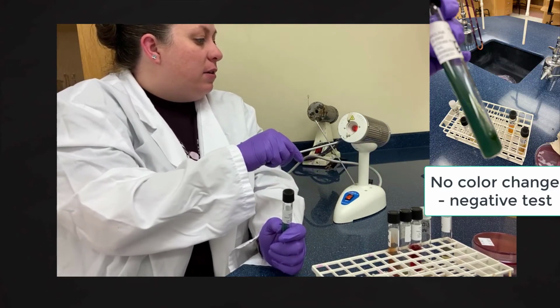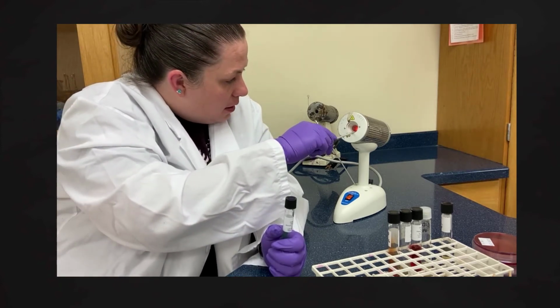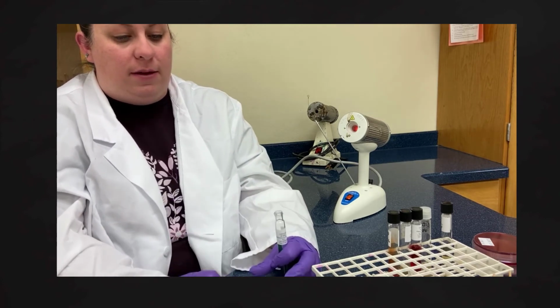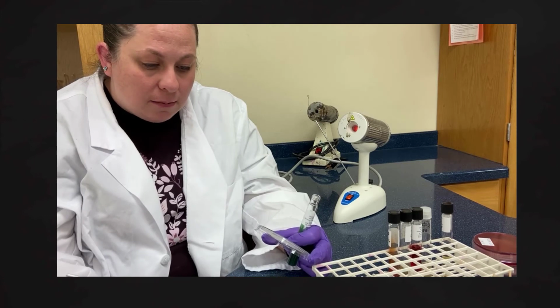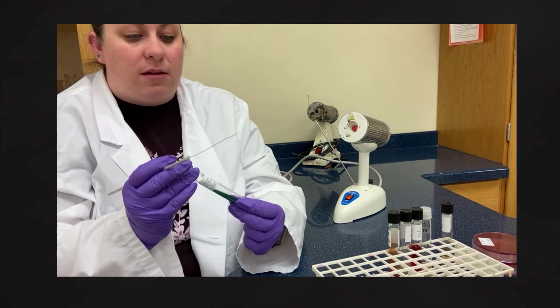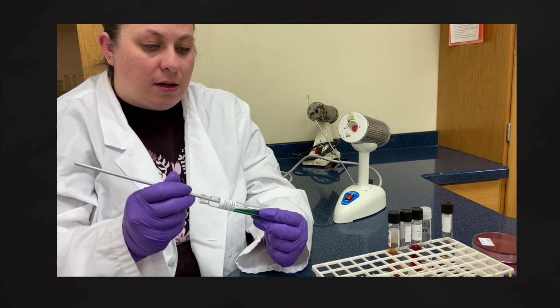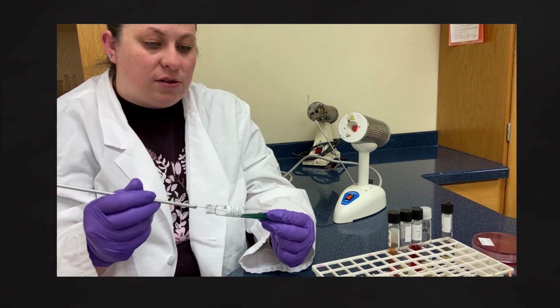So again, we're going to sterilize our loop. We're going to take our lid off. Going to collect a little bit of bacteria, and we're going to go into the deep and come and scratch the surface.